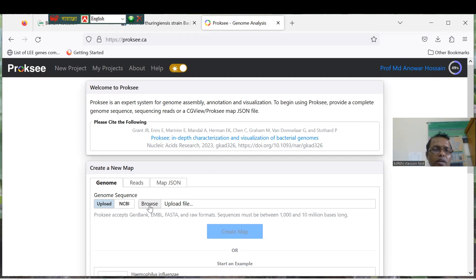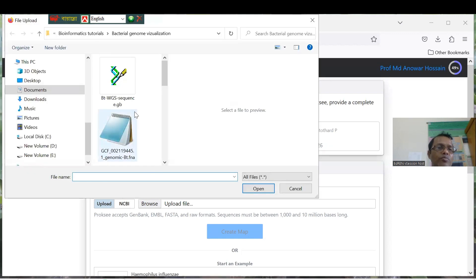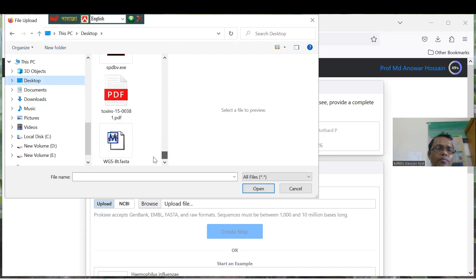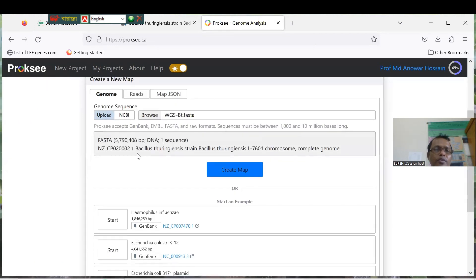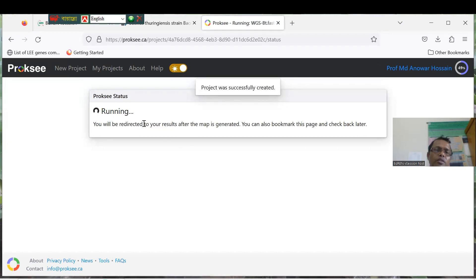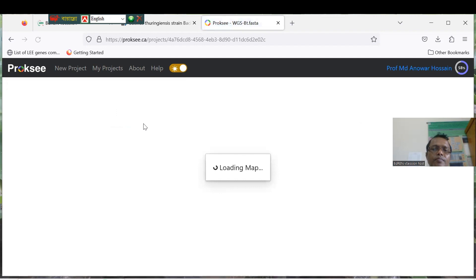Now you can see the Genome Map section. To prepare the map, just click Browse and upload your genome — the file saved on the desktop. Our full genome file is ready. Click Open. You can see Bacillus 2 is now in the system. Now click Create Map and wait a moment.